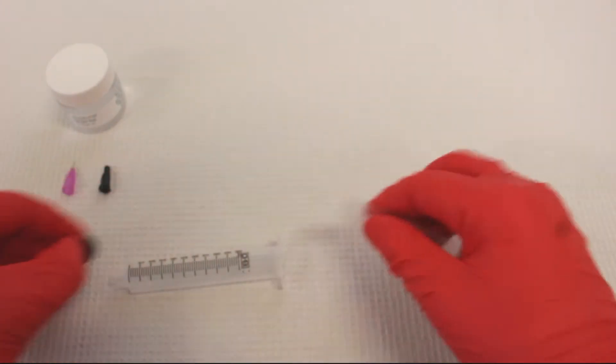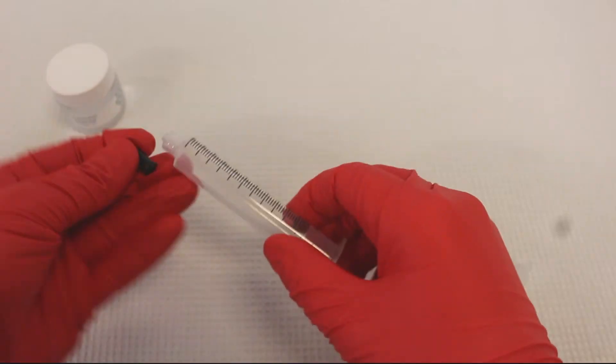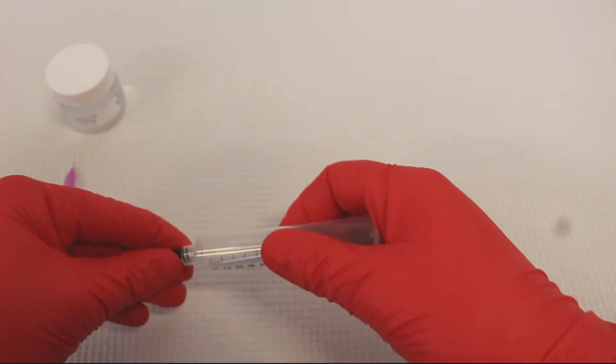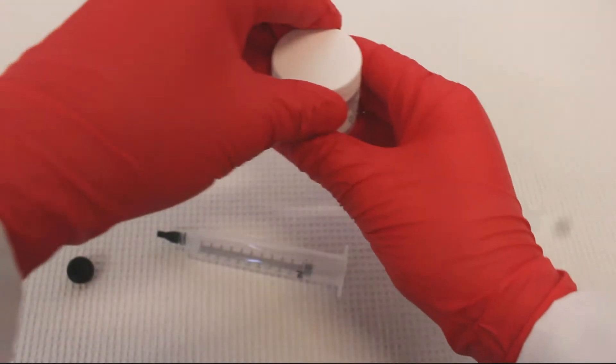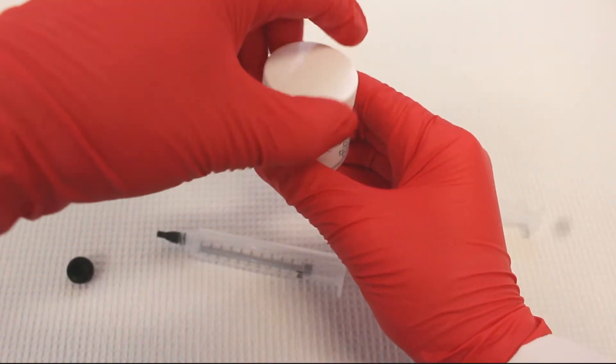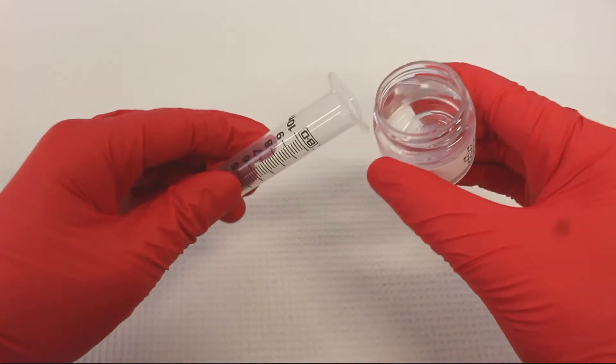First remove the plunger from the syringe and the black stock from the plunger. Add a syringe cap to the syringe. Then pour pleuronic into the syringe. We suggest loading about 3 to 5 mils.